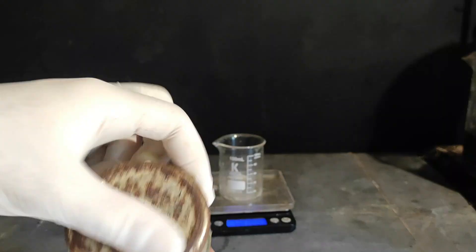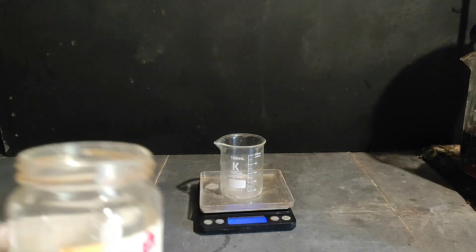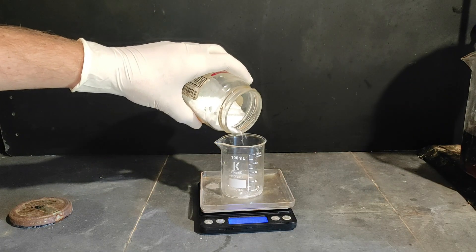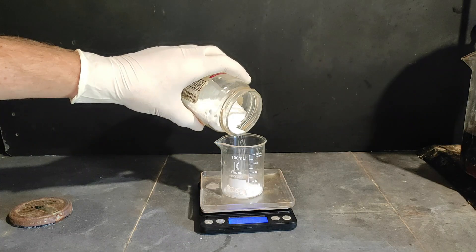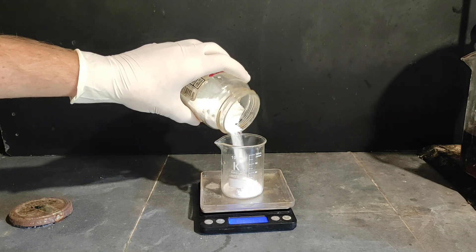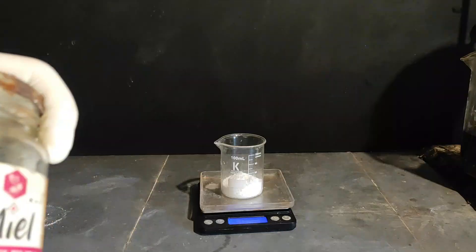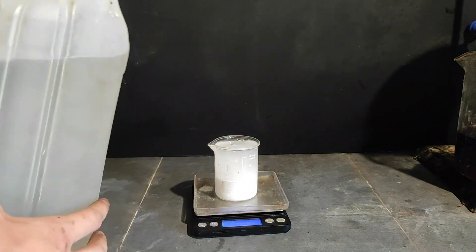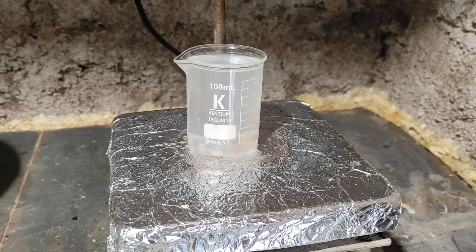I'm gonna measure approximately 30 grams of sodium carbonate. This is to precipitate the cobalt carbonate, because it's very insoluble. I'm going to measure out a little bit less than 30 grams to not overshoot, because if I overshoot, it won't dissolve. When it was fully dissolved, I added it to the cobalt chloride solution to precipitate cobalt carbonate.